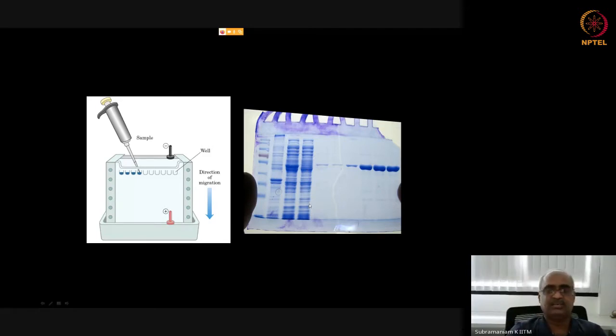So we see here, this is an E. coli strain that is genetically engineered to produce a certain protein, and that is this protein here. This is present here, not in this. So this is normal E. coli that doesn't produce that protein, and this one is producing that protein. And I have used an affinity chromatography to purify this one out. And you see here, this pure protein is visible while most of the others are removed.